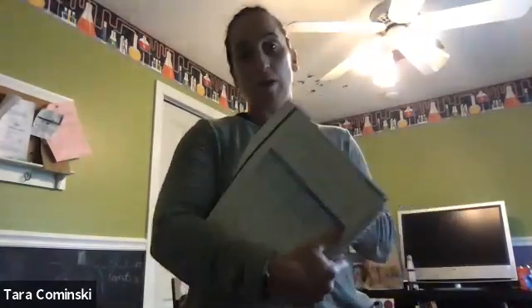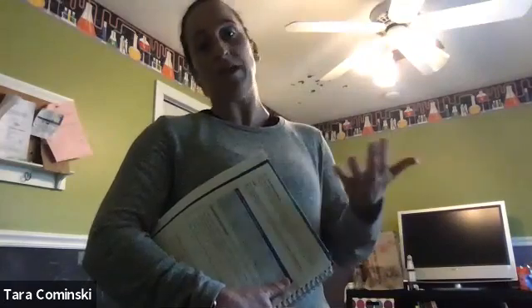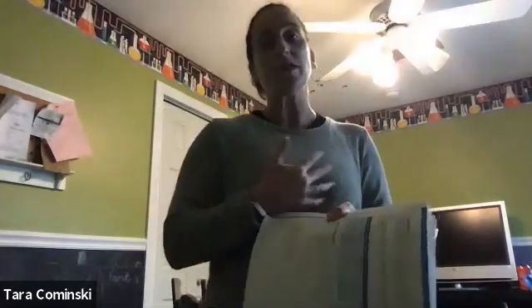So I'm not going to spend time going through any explanation of doing conversions. Now, I did a little bit, like I said, at our class meeting. There are also many resources on the internet that you might find helpful, like through Khan Academy. Also, if you need help with the metric conversions, please email me and we can set up a time to go over them independently, okay? So I'll leave it at that. As you go through this lab, you're going to be practicing those conversions anyway.